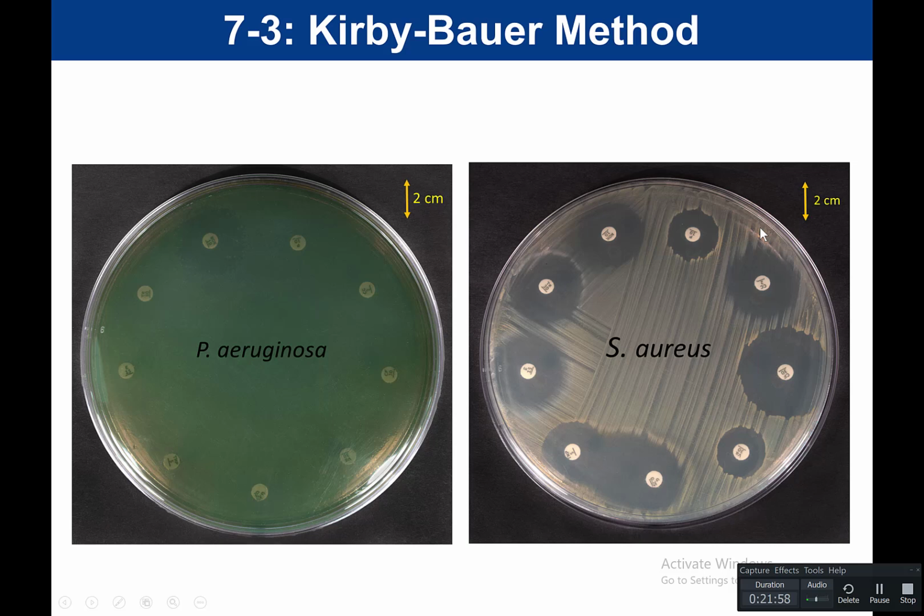Here are the results for Staph aureus. So you can see that Staph aureus generally doesn't have too much resistance. Now be aware that this Staph aureus is not the antibiotic resistant strains. This is just typical Staph aureus. Not all Staph aureus are the same. There are what we call strains. There are different versions of Staph aureus that have different levels of resistance.